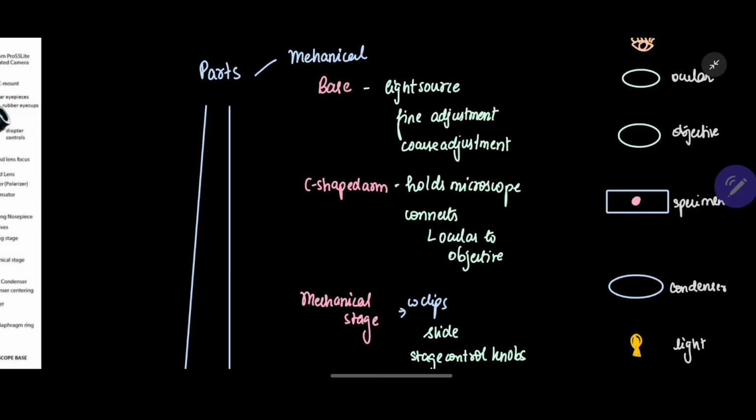Now I said that in a light microscope, the specimen is going to be stained. So imagine this specimen is stained. The specimen is going to absorb some light in itself. Again, let us go back to your light beginning from here. There's light going on from the light source. Your condenser is gathering that light and giving it to your specimen.